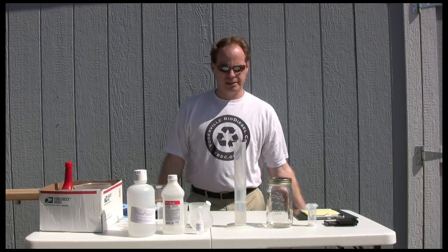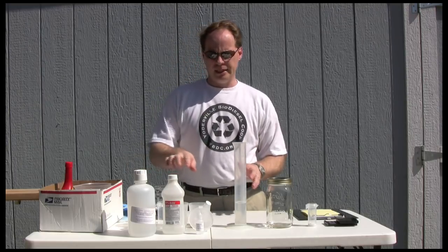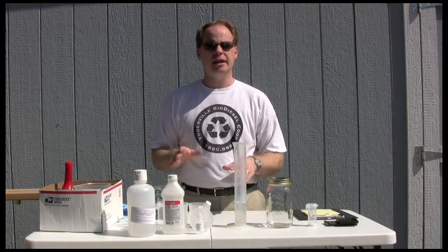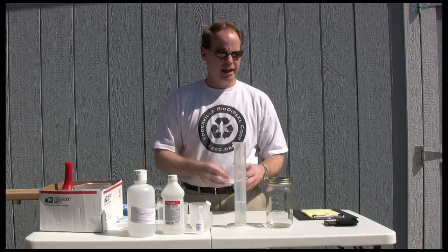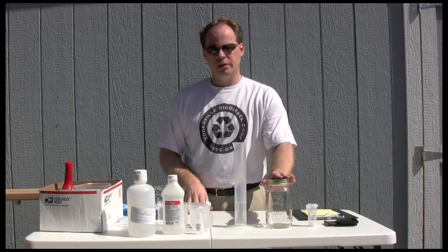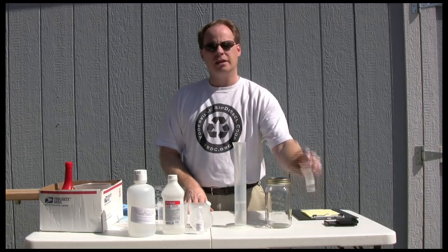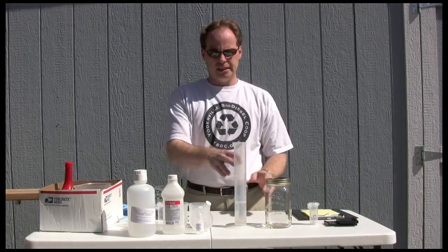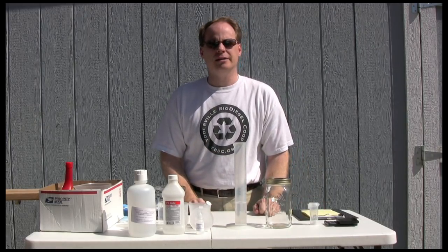Hi, my name is Graydon Blair from Utah Biodiesel Supply and today we're going to make a batch of biodiesel from waste vegetable oil. First thing we're going to need to do is titrate this oil to see how much catalyst it's going to require. We're going to use potassium hydroxide as our catalyst today. We'll then measure out 400 milliliters of oil, mix out the appropriate methanol, mix in our catalyst, mix it all together, put it in the jar, shake it, and then we'll let it settle out and we'll have finished biodiesel.